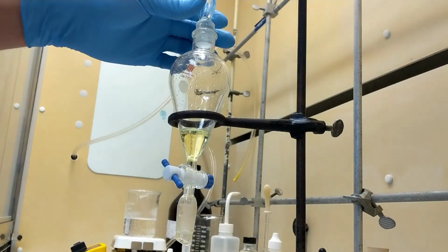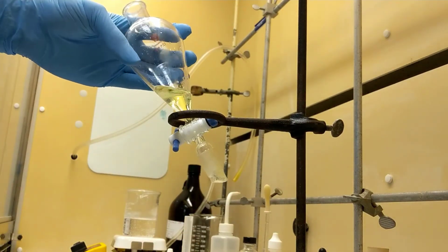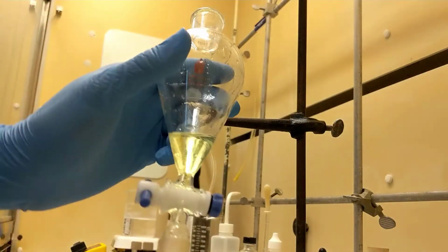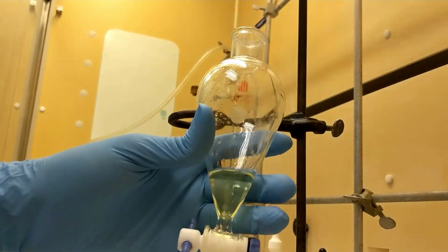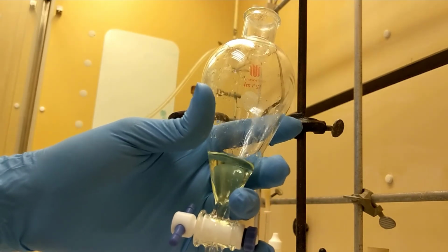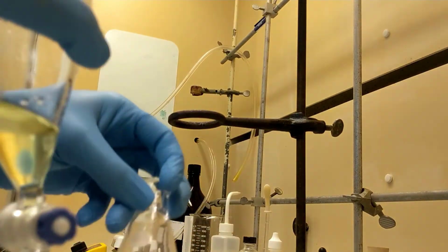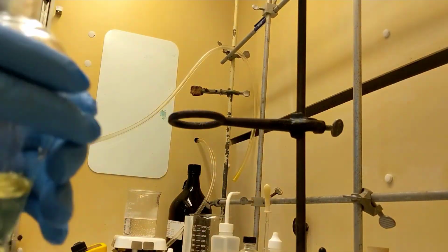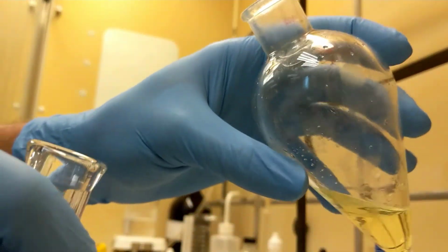Alright guys, I need to show you how you're going to pour this. Since our extract is over, the solvent that our solute is in has been the top layer the whole time, and we've been filtering things out of the bottom. Instead of just putting this flask underneath the separatory funnel and draining it out, I'm going to pour out of the top. Okay? So let's see if I can get this on here.